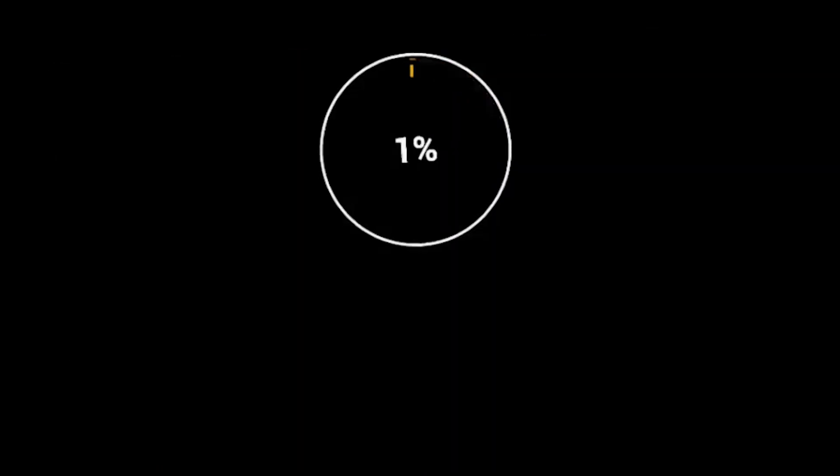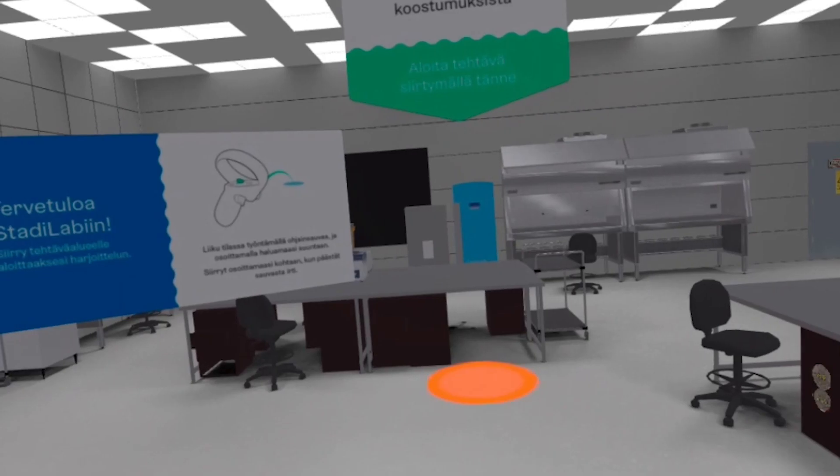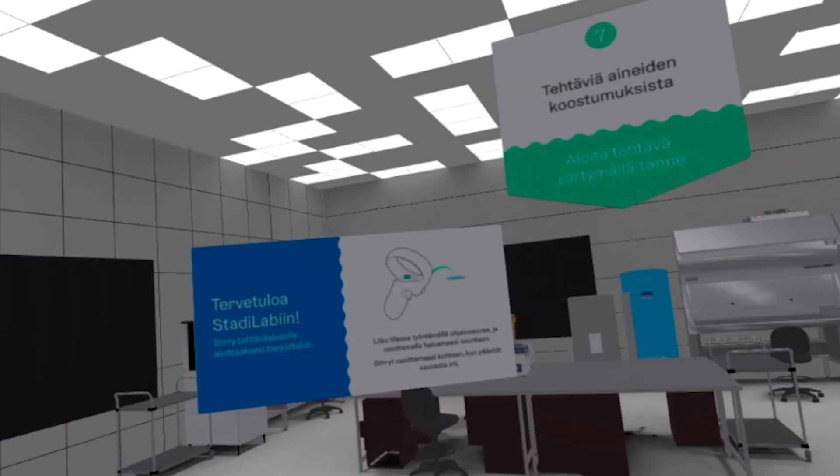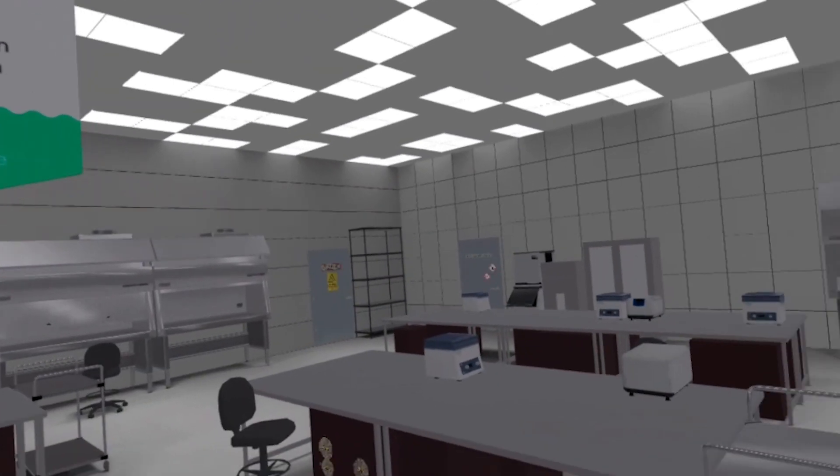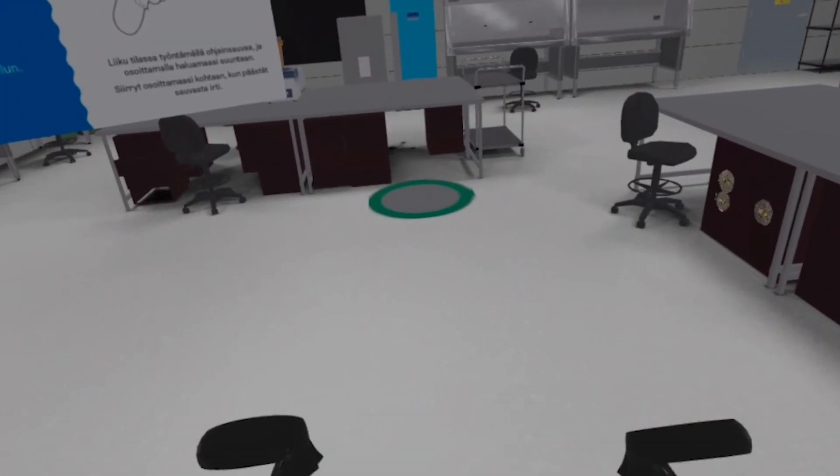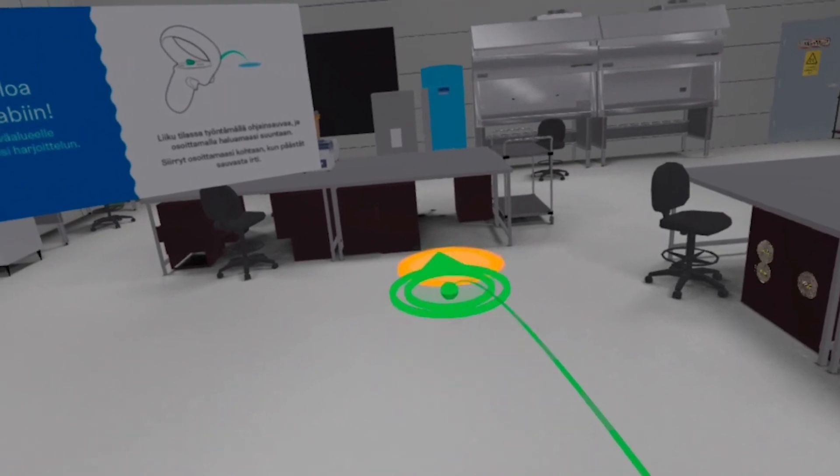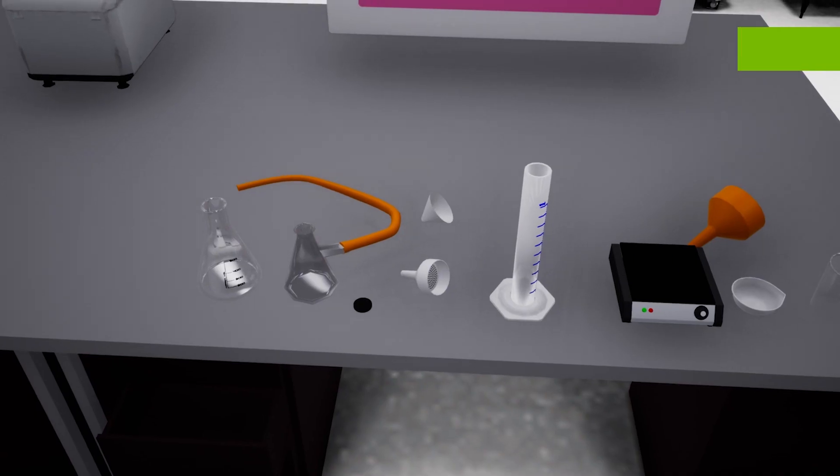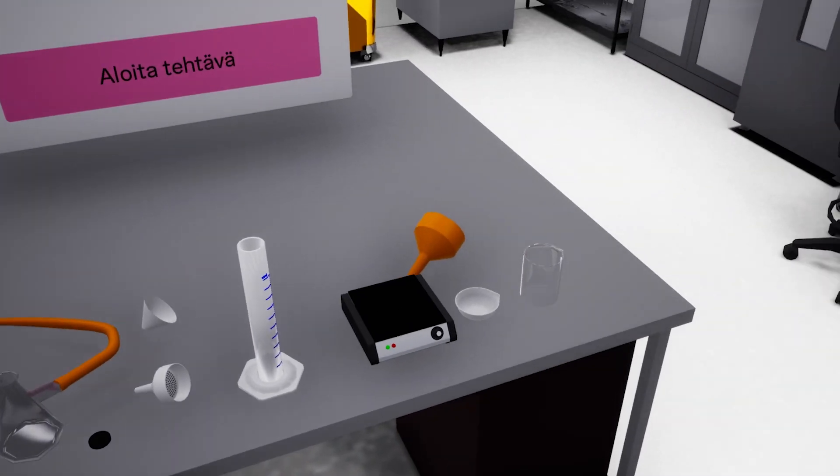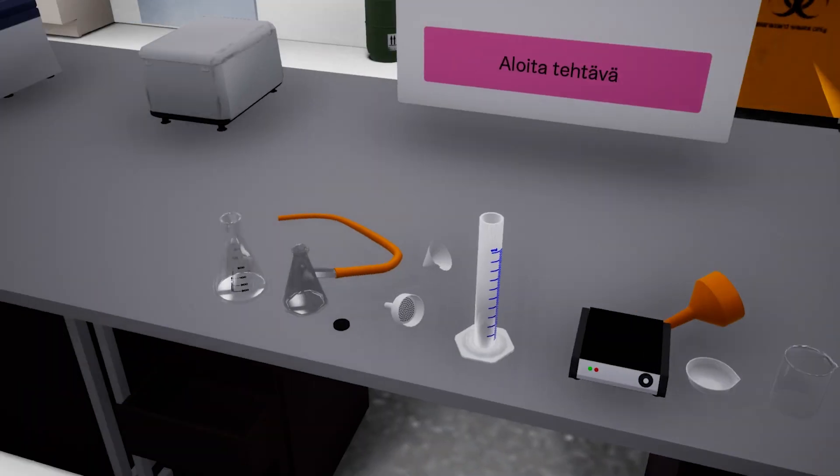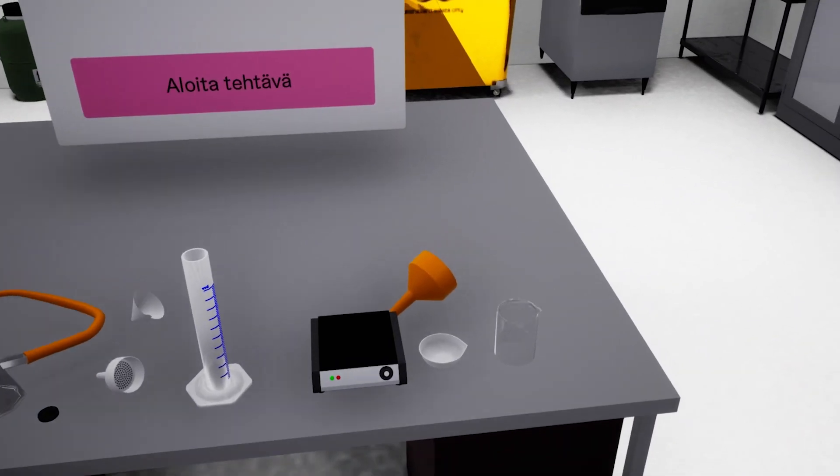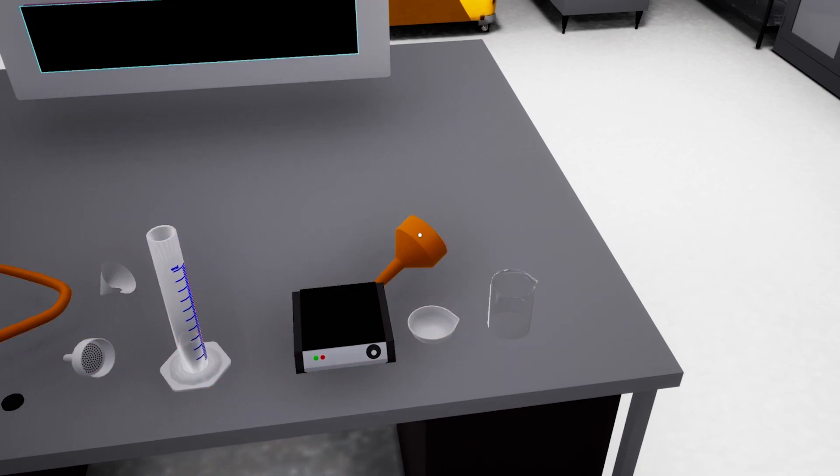Stereoscape created their first VR learning experience for students studying laboratory technology called StatiLab. We wanted to create a smart and efficient training that would also be visually pleasing and easy to use.